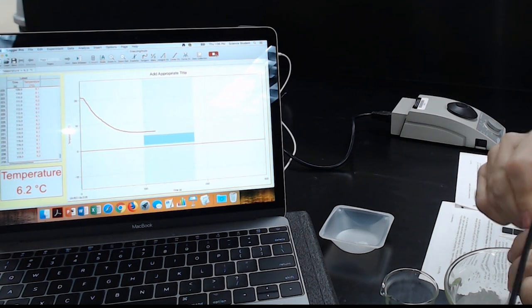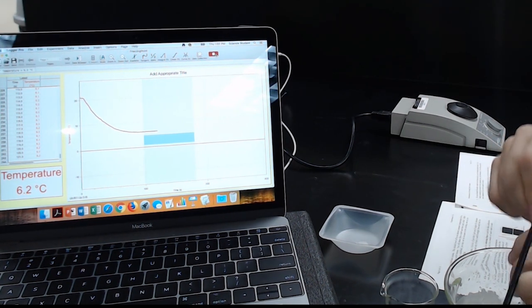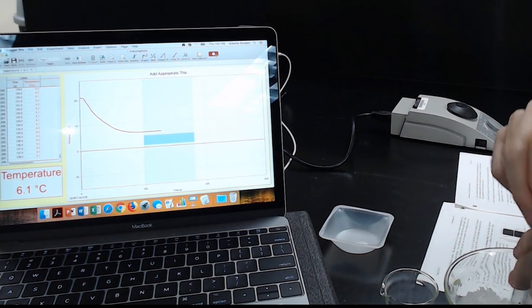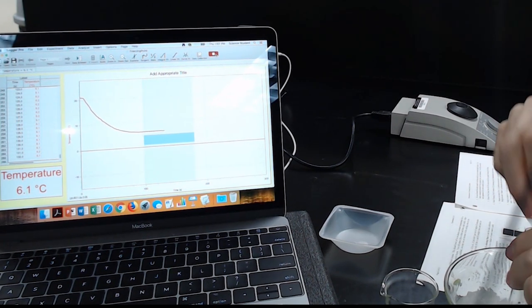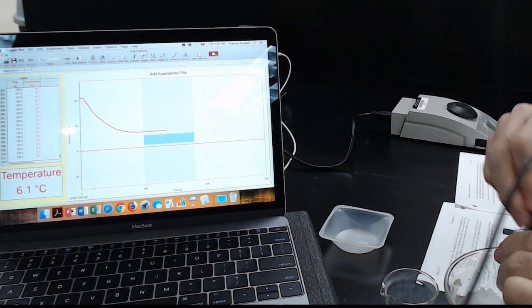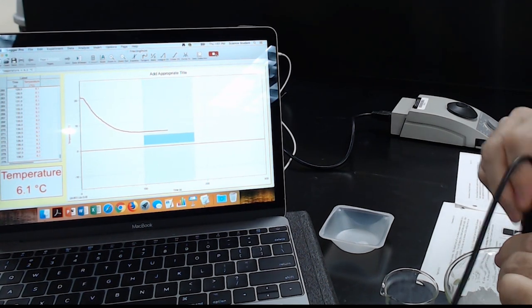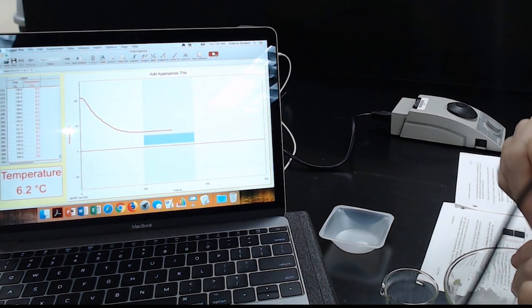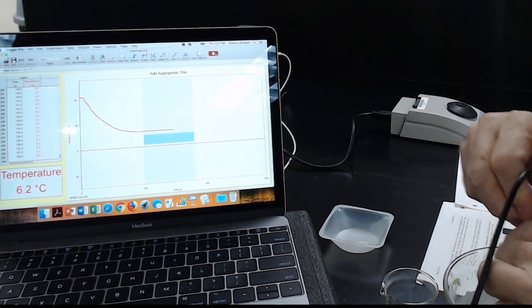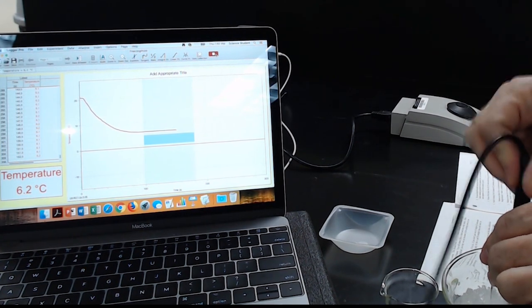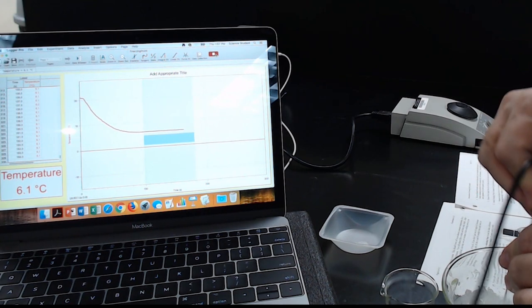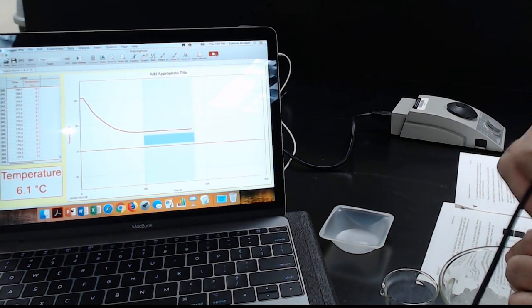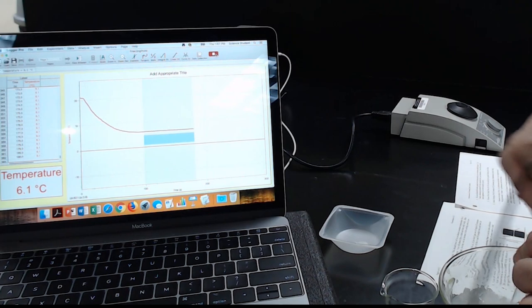Now, even if we don't have the freezing point of the cyclohexane compared to the literature value, what matters is not the absolute temperature but the difference in temperature between the pure solvent and the solvent with the naphthalene in it. And so your delta T is what matters. And so even if this temperature is off a little bit, don't worry about it. It's going to be pretty close to the freezing point in the literature here I see. So you can see we're starting to level out here. So the cyclohexane is freezing. In fact, it's definitely cloudy. I'm sorry. But I just wanted to show you that it is in fact freezing. It didn't show in the data when you took it out.